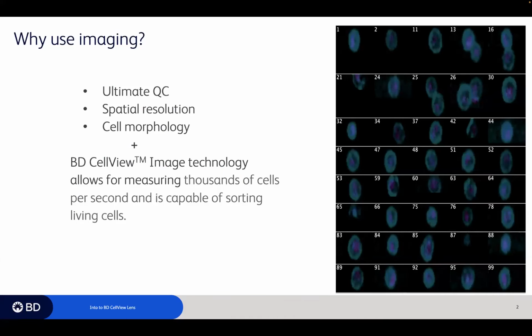Okay, so it's always good to start a presentation with the why. So why are we interested in imaging? Why are we interested in using imaging? The focus of the discussion, of course, is going to be the software and the data analysis. But let's start with some of the background on the why, and the technology that develops the information that we're going to be able to use for analysis in the software.